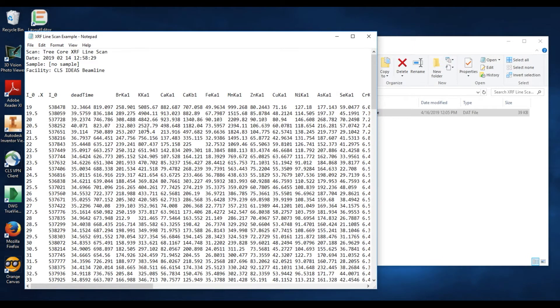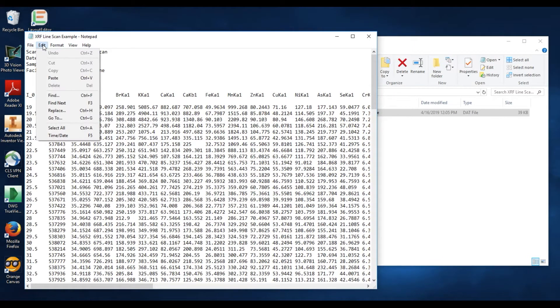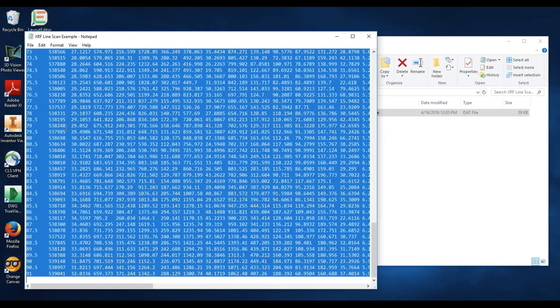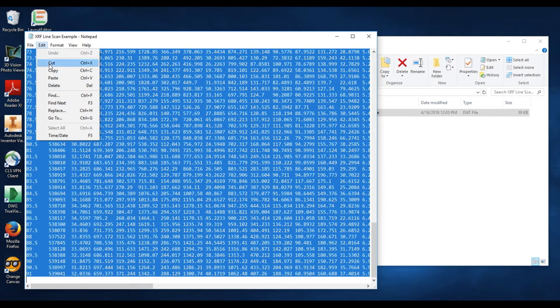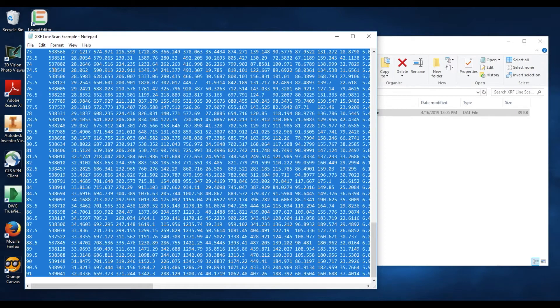Now here is the XRF line scan data and we would like to copy it all. Select the Edit menu and choose the Select All option. Select the Edit menu again and choose the Copy option. Now we would like to paste it into Excel.